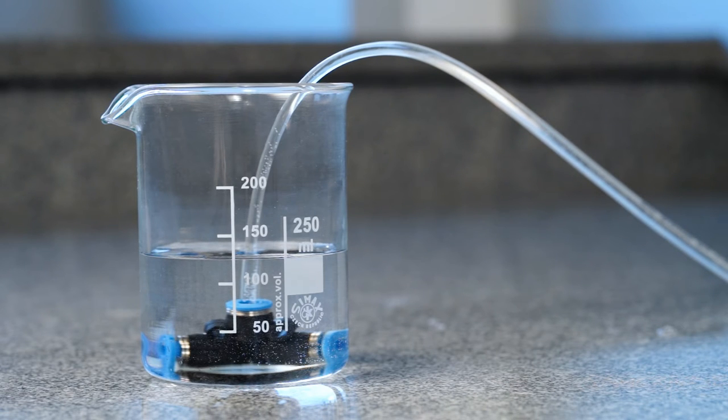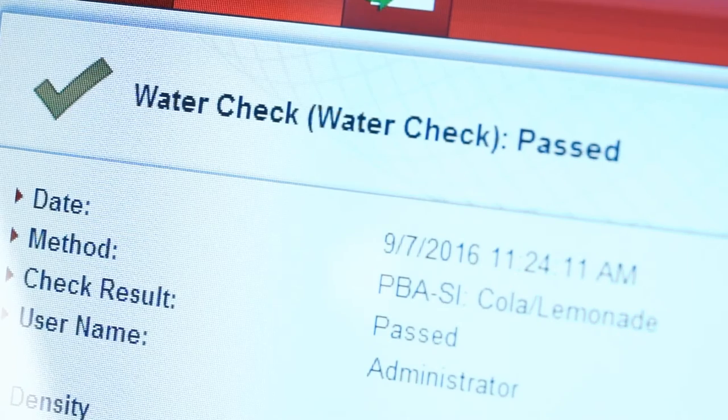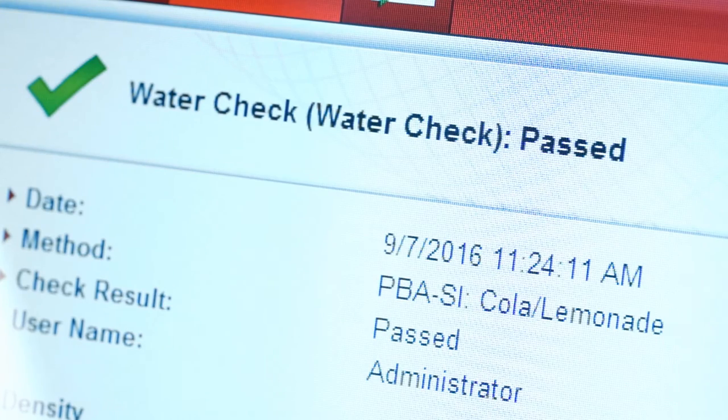For each additional measuring module, about 20 milliliters extra need to be added. The instrument will automatically present a report at the end of the water check. Even if the water check has failed, the instrument will tell you.